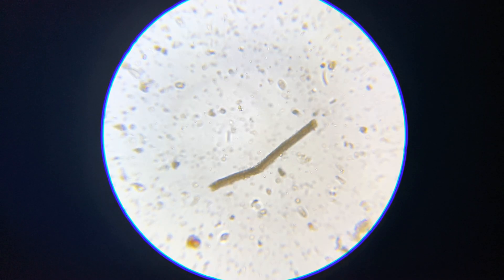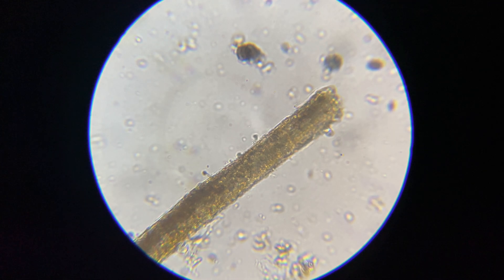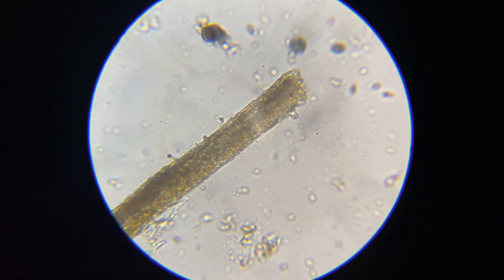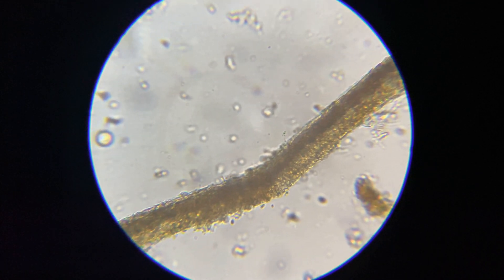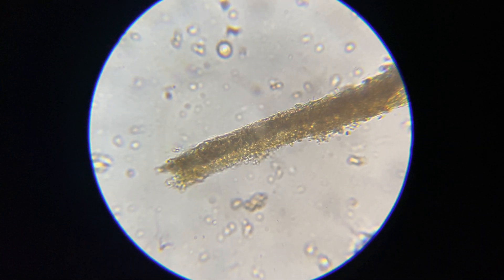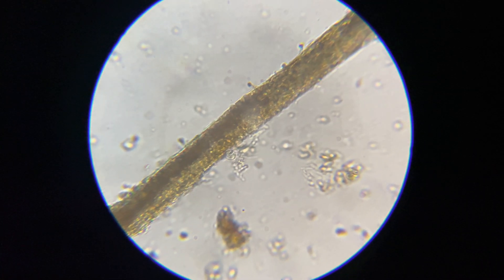Here is a fungal hyphae. As we zoom in closer you can see all the different organisms around it — some good aerobic ones, some testate amoeba. If you notice here, you see little glimmery crystals around the outside of this fungal hyphae. Those are oxalate crystals, which contain charged nutrients and are very beneficial. When you see a fungal hyphae like this, you know it's extremely beneficial. Another characteristic is that it's extremely wide, which is another good beneficial indicator, as well as its dark color.